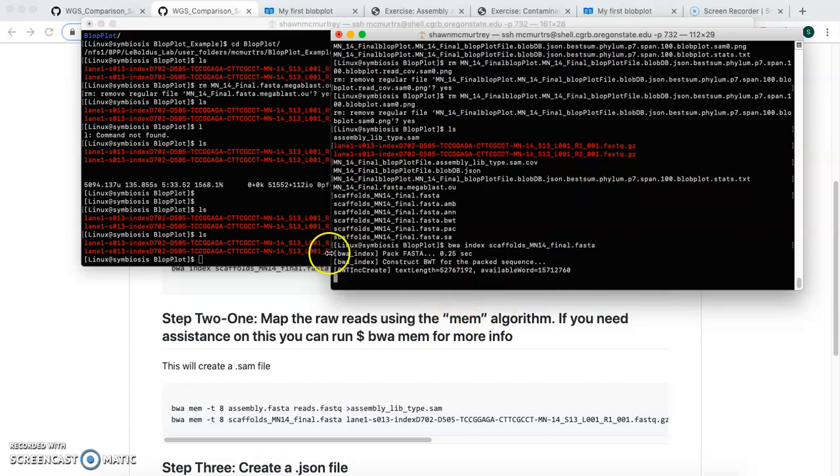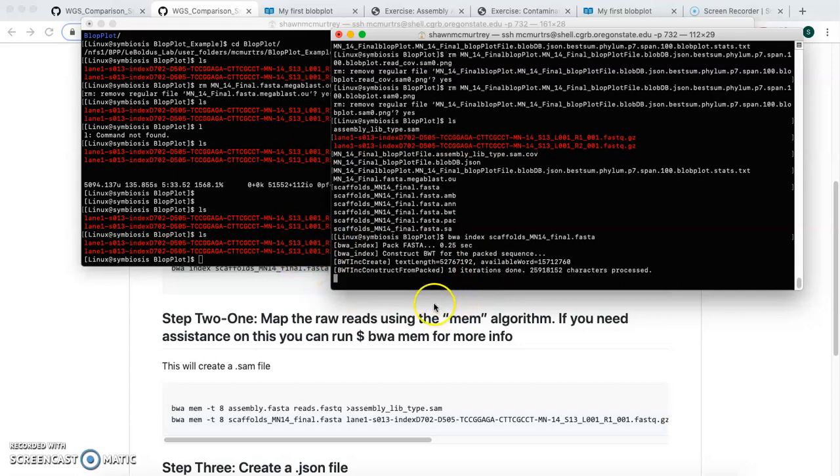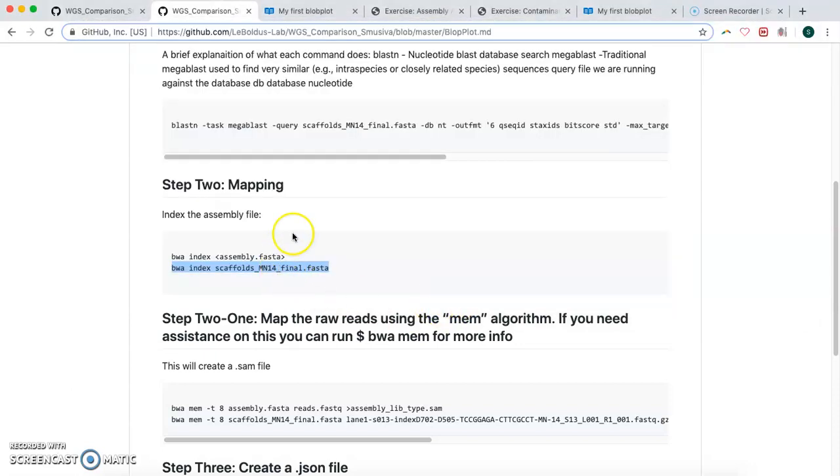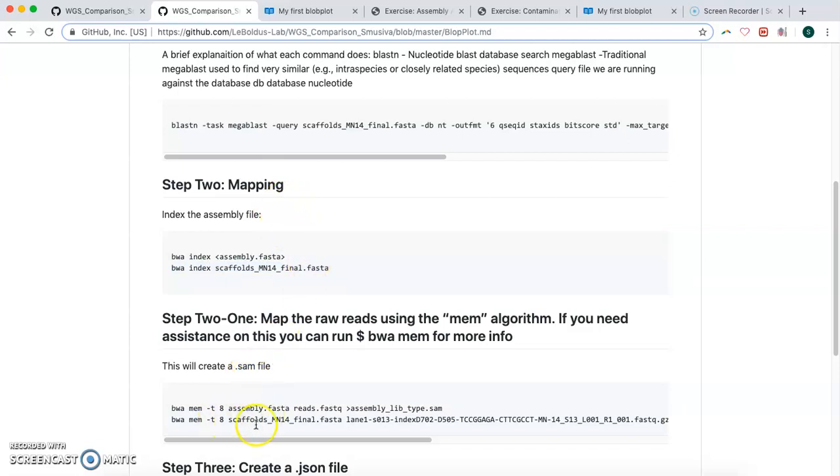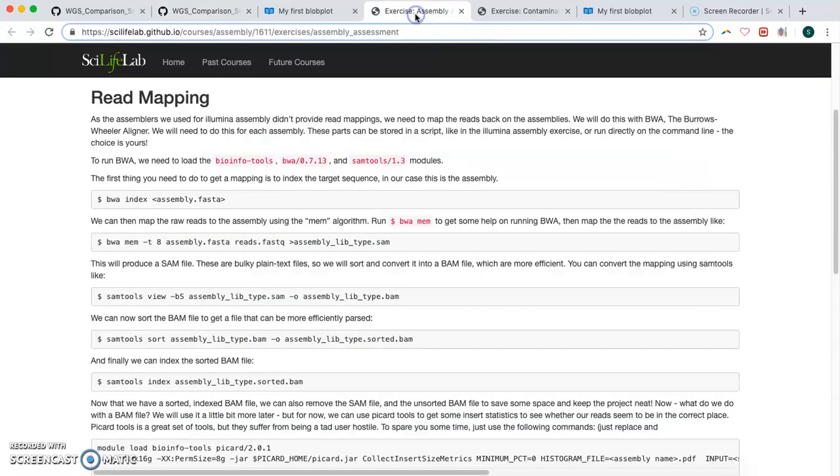And then once that's been indexed, then the next thing we're going to do as part of the mapping is we're going to create a .sam file. And that's done with the bwa, that's another program, Burrows-Wheeler Aligner.